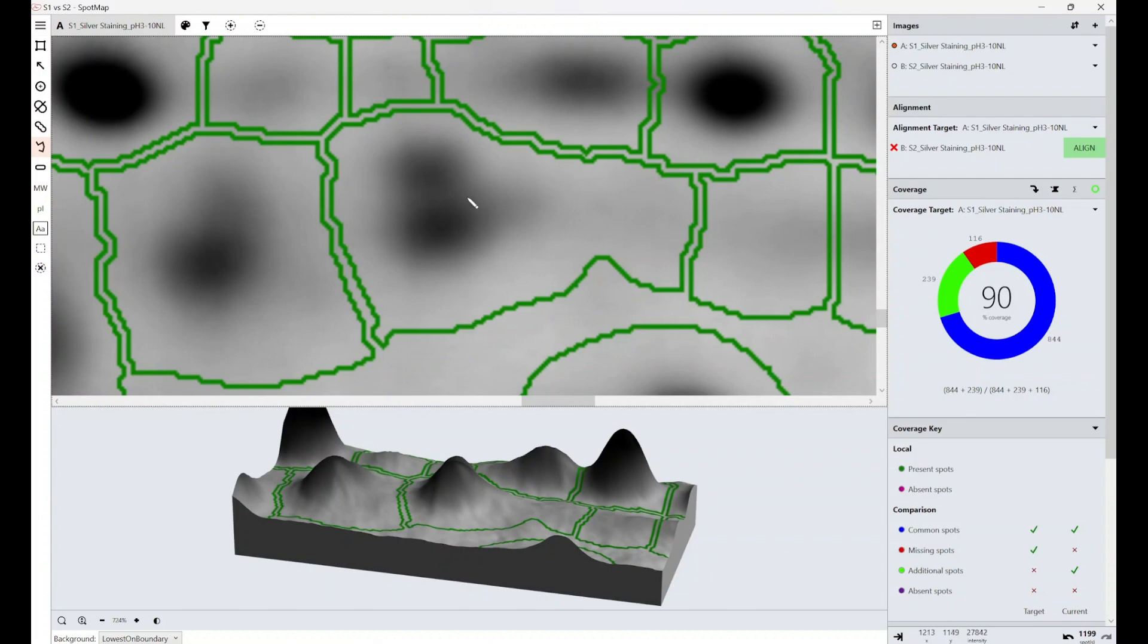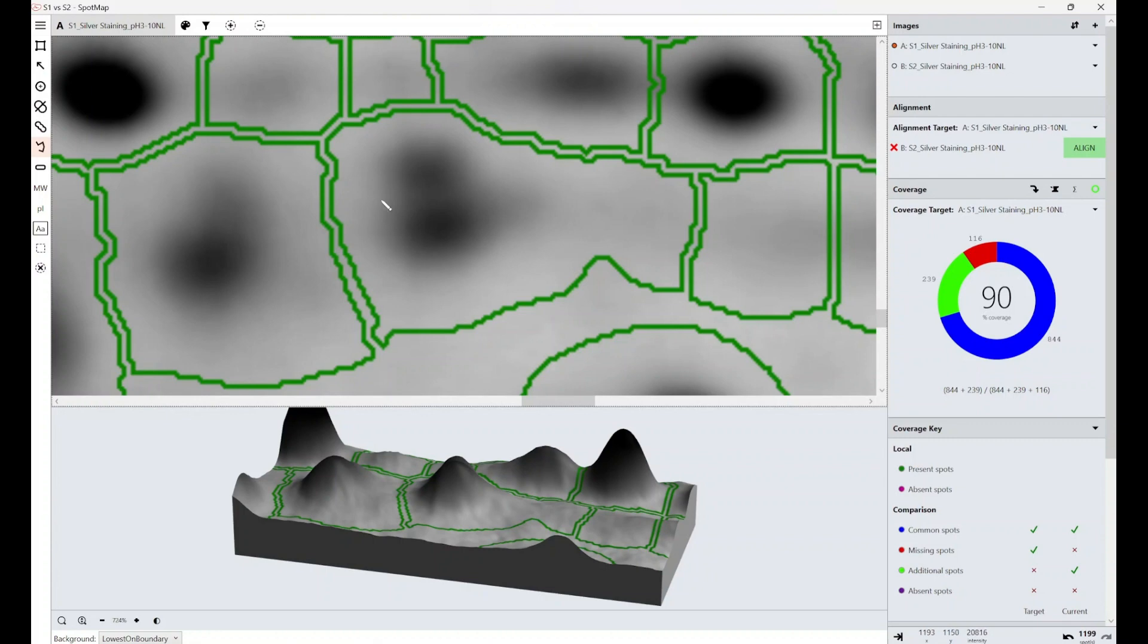Now, you can see here the signal is very similar across both of these spots, and it's only through human vision that we can determine that these are likely to be separate spots. The computer software is unable to draw a neat line between these because the signal here between them is still much higher than the background. Spot detection algorithms cleverly distinguish background from signal, but this all just looks like signal.